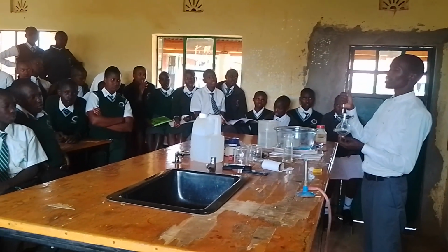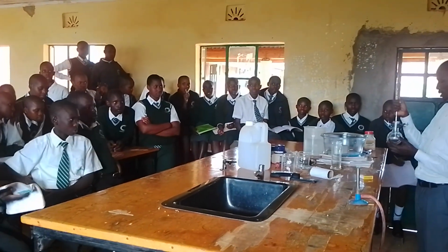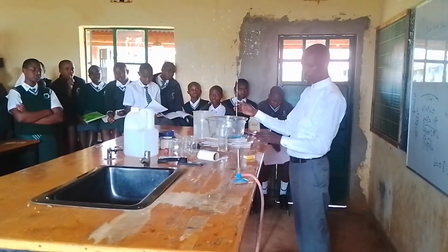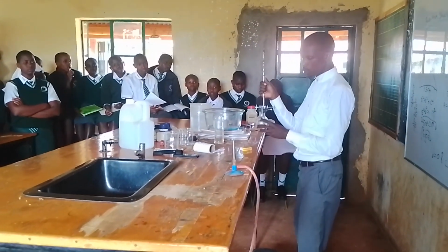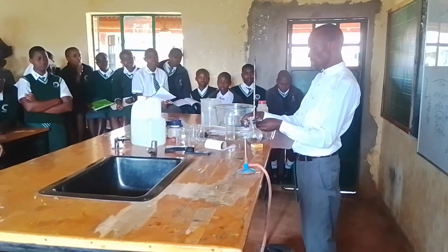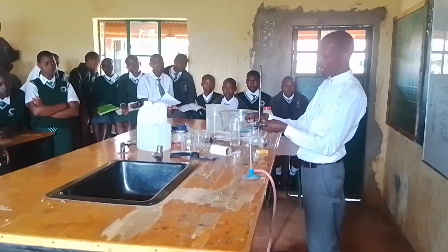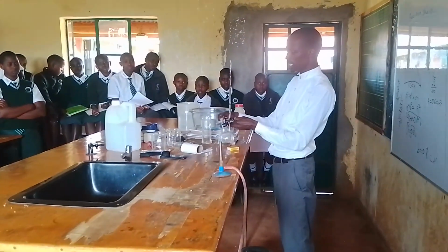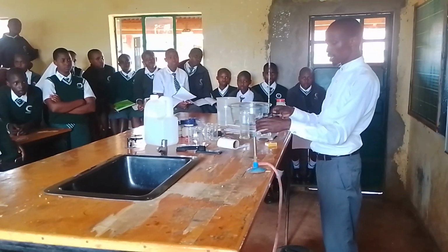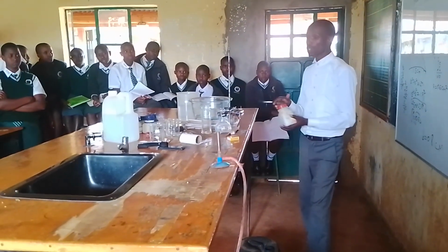No, I don't want correct answers. What is the role of a catalyst? Just speed up. To speed up the rate of a reaction. And therefore, without wasting time, we want to place some spatulas of our catalyst to begin with. We'll begin by placing the catalyst, and then thereafter we place the hydrogen peroxide, which is going to decompose to give us oxygen.